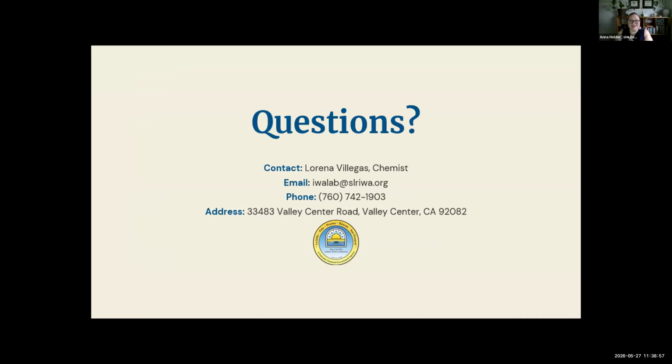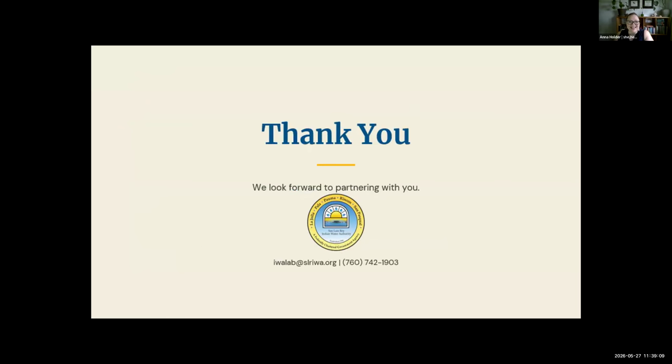That was so great to hear about the history of your lab and your capabilities and how you're serving tribes locally and beyond now, it sounds like. And it was good to hear from your perspective the reminders of keep your samples cold, keep them dark, to make sure you get really high quality analyses back. So we didn't even plan for that. So it's good to just reiterate those important tips.